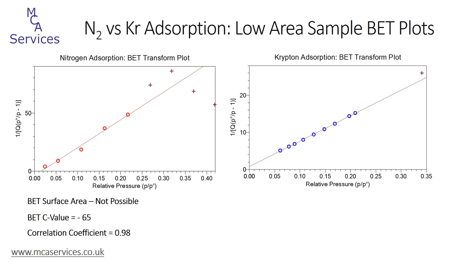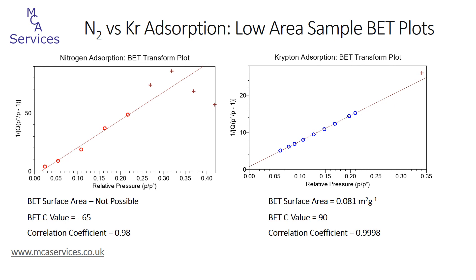The BET transform plot for krypton, on the other hand, is totally different, as we would expect from a reliable looking isotherm. The BET range can be fitted with good linearity throughout a significant number of relative pressure data points, shown by the blue circles. The BET surface area is 0.081 square meters per gram, the BET C value is positive, and the correlation coefficient is high. So we can say with confidence that the BET surface area of this material is much better represented by krypton adsorption than by nitrogen adsorption.